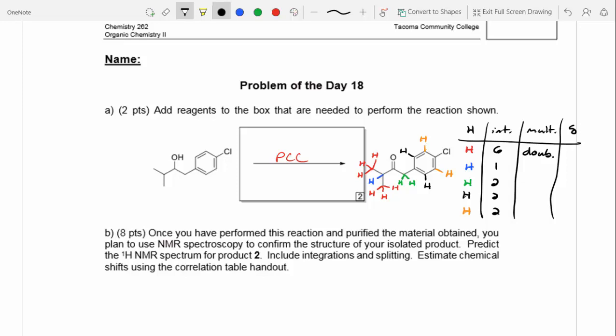All right, now let's think about the blue proton. How many 3-bond neighbors does it have? 6 total 3-bond neighbors to that blue proton. Why don't we count the green protons? Because there's 4 bonds separating them, right? So if we count sigma bonds, those green protons are 4 sigma bonds away. We don't count them. So the red protons are 3-bond neighbors. We've got 6 of them. What will the splitting be? A septet. Okay? Which is a signal splitting of 7 if you're not familiar with that prefix. All right, what about the green protons? How many 3-bond neighbors?